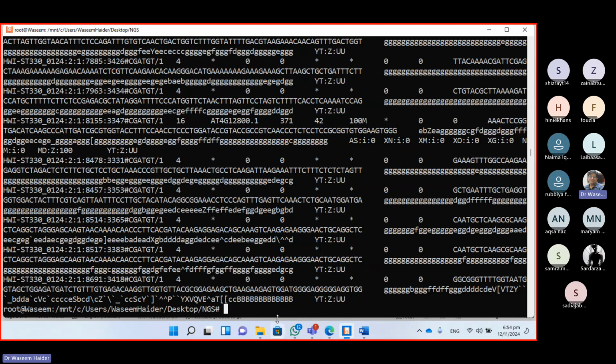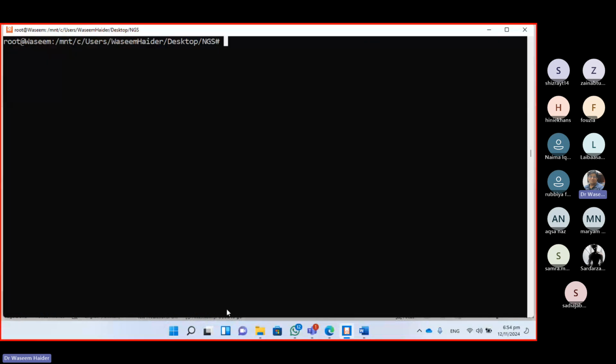Okay. Right, so this is how we aligned this read file, and we just displayed it on the console, but you can't do anything about it unless you store it. So how can you store that output file? You again write this command, but you direct your output into a file. That greater-than sign means anything that is the output of the command on the left side, place it into this file. I just write that file name as mu1_output. So that's my output file.